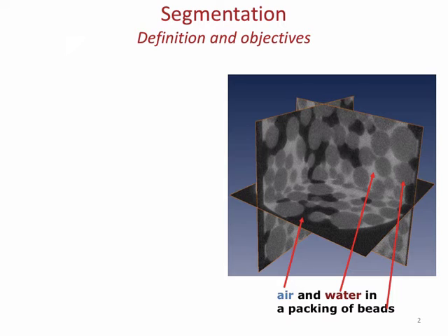So you likely did some filtering with the grayscale image in order to do a better job with segmentation, and then after that, you might need to do it again. All right, so we start with a tomographic image. Then I have to choose an algorithm to identify what is my pore space and grain space. In this particular case, you might have a different problem, but the simplest is this binary segmentation. And I have to choose a segmentation algorithm well.